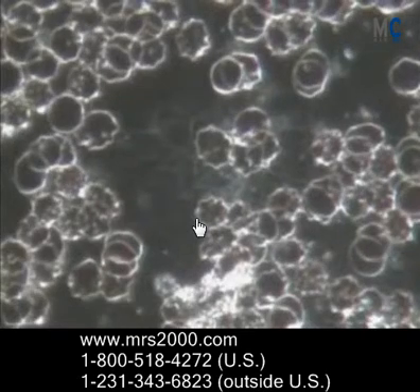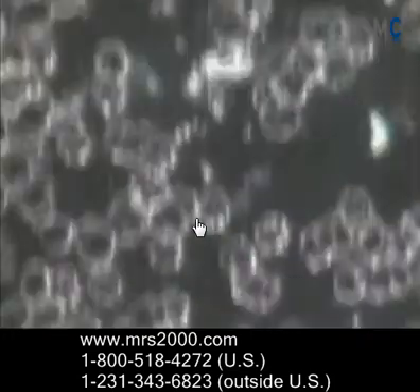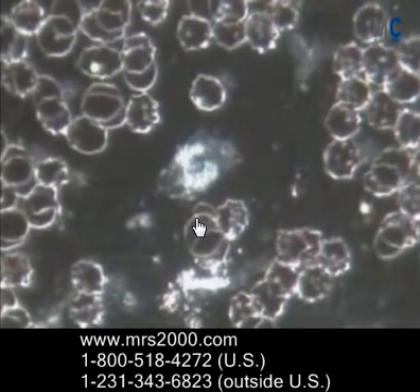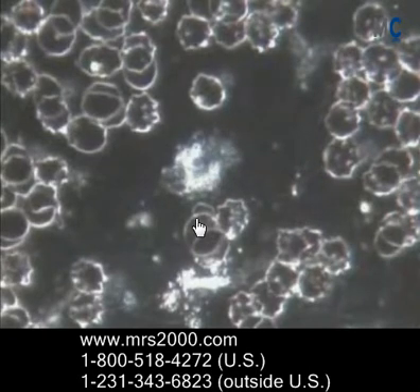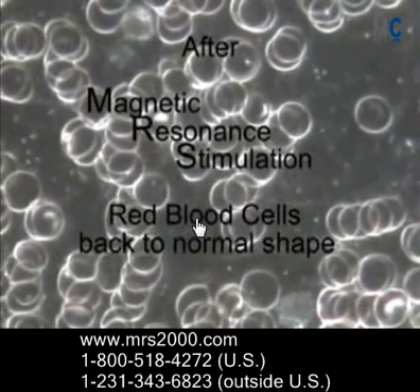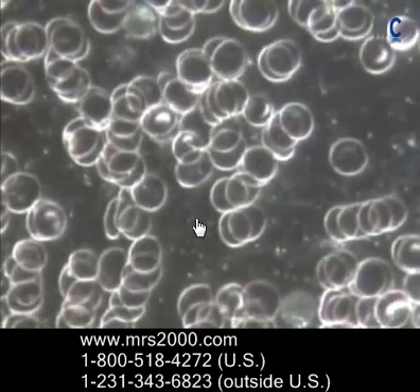The rouleaux effect — this clumping due to lack of charge and decreased voltage — is not good because the capillaries are very, very small. The arteries and veins all come together at the capillaries, and this is where nutrients are absorbed into the lymph and then go into the cells, because pretty much all your cells in your body except the red blood cells and certain immune cells are in the lymph. When the cells all clump together, they can't even get through the capillaries because the capillaries only allow single file.